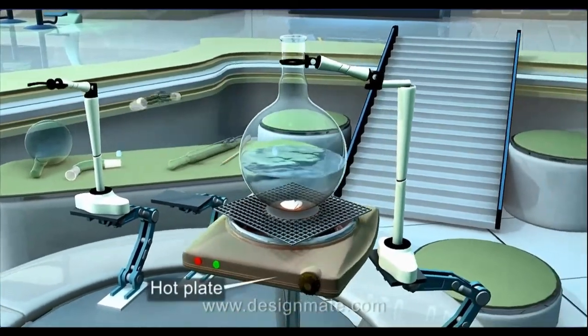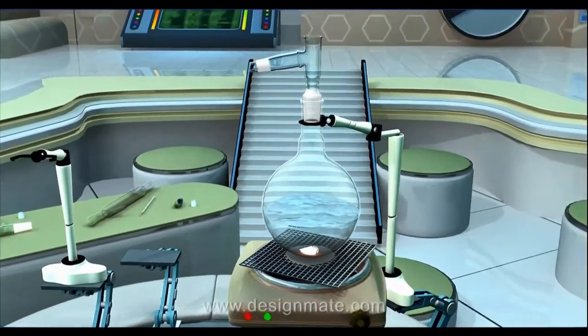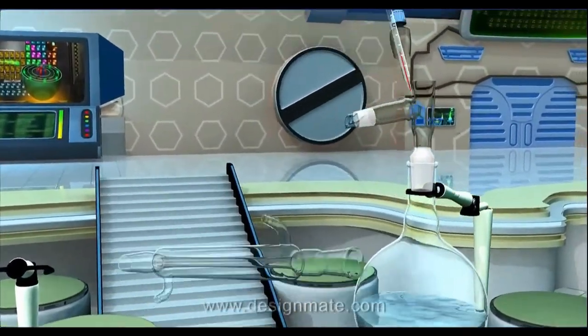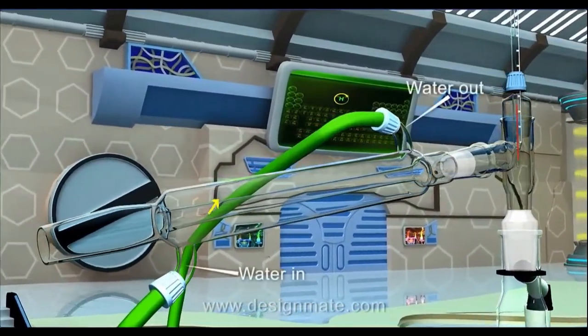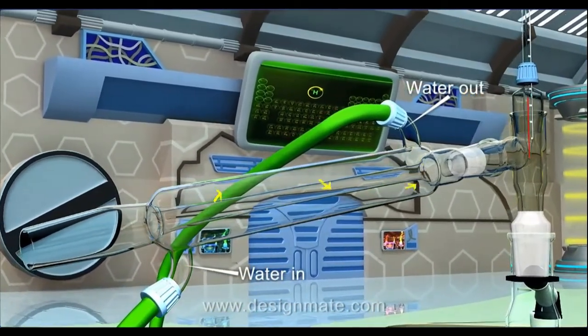Position a hot plate underneath. Now, connect a distilling head to the RB flask. Subjoin a thermometer to one end and a condenser tube to the other end of the distilling head. The condenser tube has an inlet that lets cold water in and an outlet from which this water escapes.